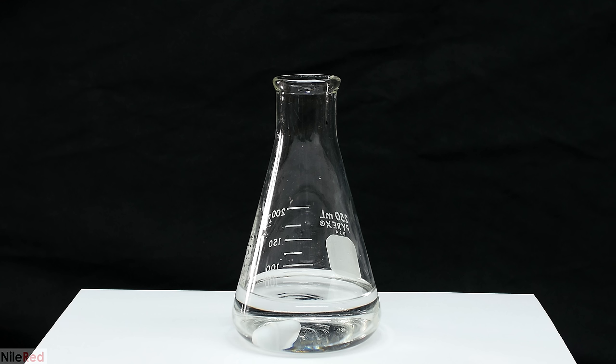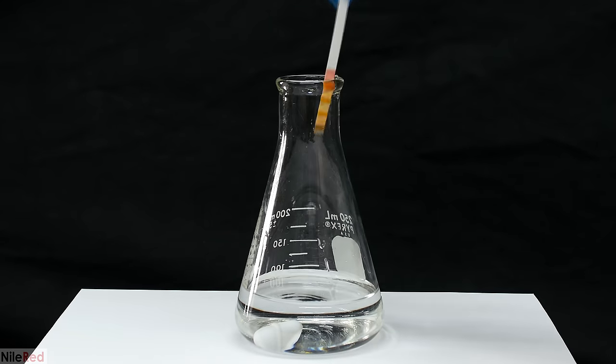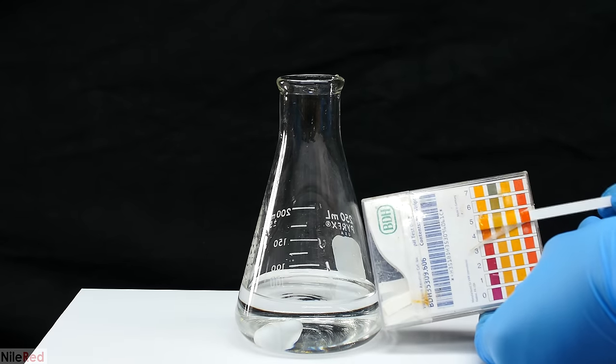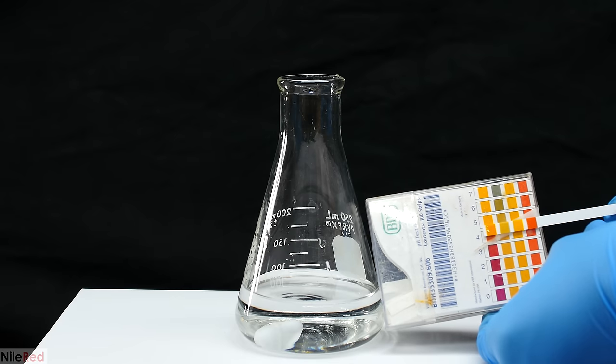According to the paper that I got this procedure from, a pH of 5 was extremely important. When they didn't use a buffer and the pH was allowed to change, they found that the reaction actually took a different pathway and led to the wrong product. Anyway, just for fun, I used a universal pH strip to verify that we had a pH of about 5.